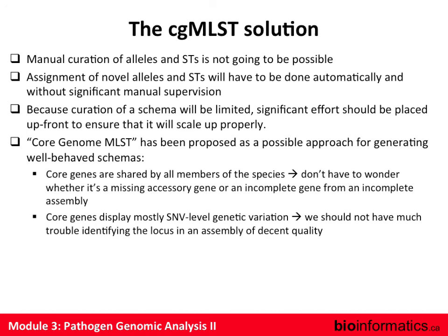So a number of different groups have proposed the idea of core genome MLST. Why? Because core genes behave better in general. We're sacrificing information at the expense of better trackability, better behavior. So yes, you sacrifice some information, but by the same analogy to what Gary was talking about, we sacrifice what's noisy. Who cares, right? It'd be nice to have it, but if it's just going to cause problems, it's not worth it.